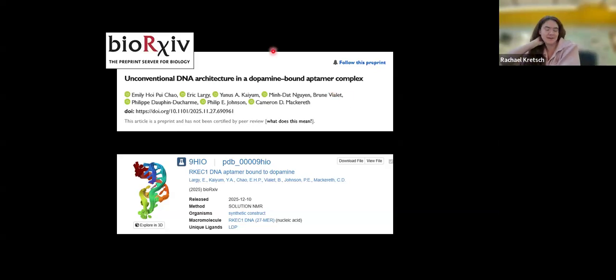I'm going to get us started on a prediction question. We talk a lot about data assisted prediction, and I think NMR comes up a lot in can we give predictors the 1D spectrum, have them try to predict what the RNA is with that kind of data assisted prediction, and then use the 2D spectrum or more advanced NMR to assess how well they did. What are your thoughts on applying this to nucleic acid structures? Would it be helpful in general for your experimental workflows? Any comments you have on that?